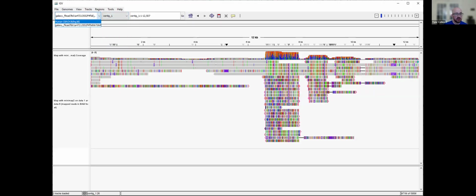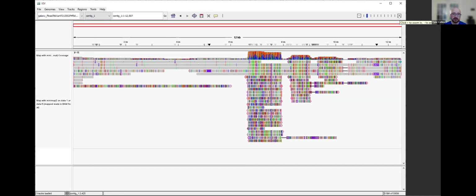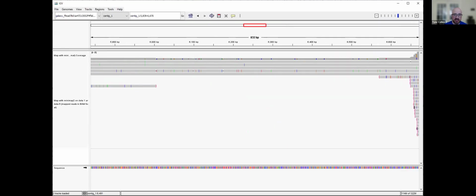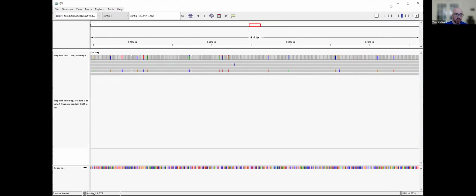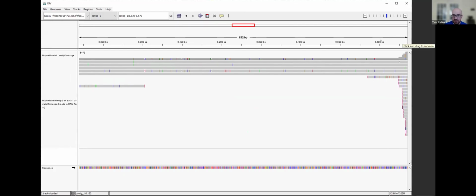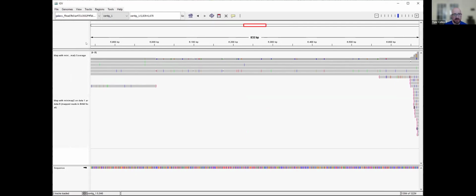In addition, we'll have our BAM data down here on the side on the track. So if we want to take some early close looks at contig number 1, we can zoom in here at the start, the original base pairs. We won't go super in depth on how to stylize this, but here we're looking at an 832 base pair region of that contig, starting from about 5,800 base pairs in to about 6,700.